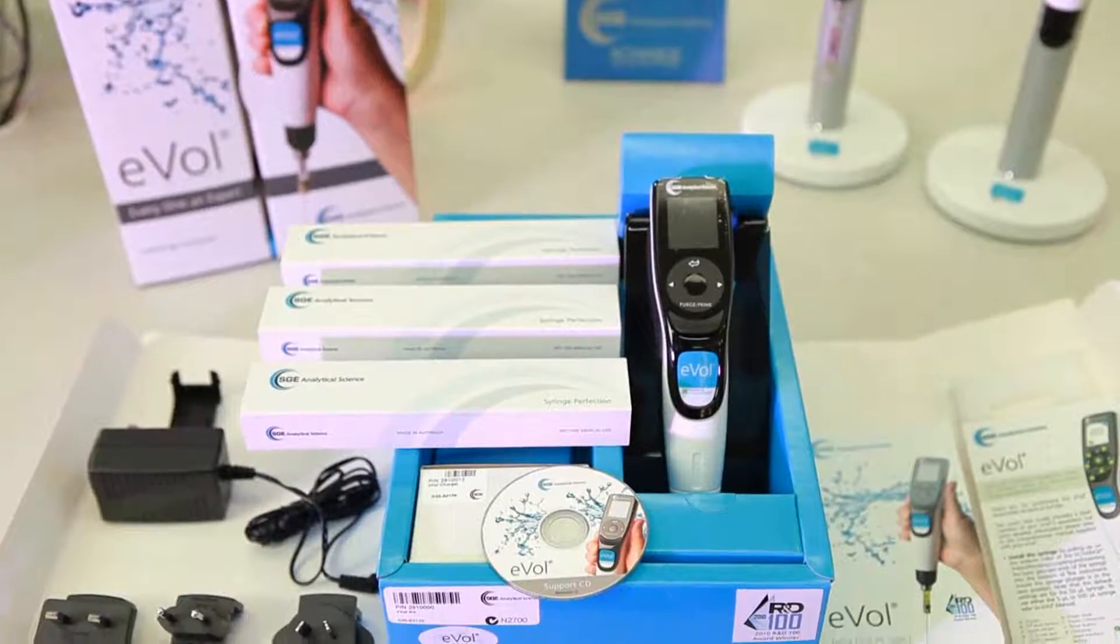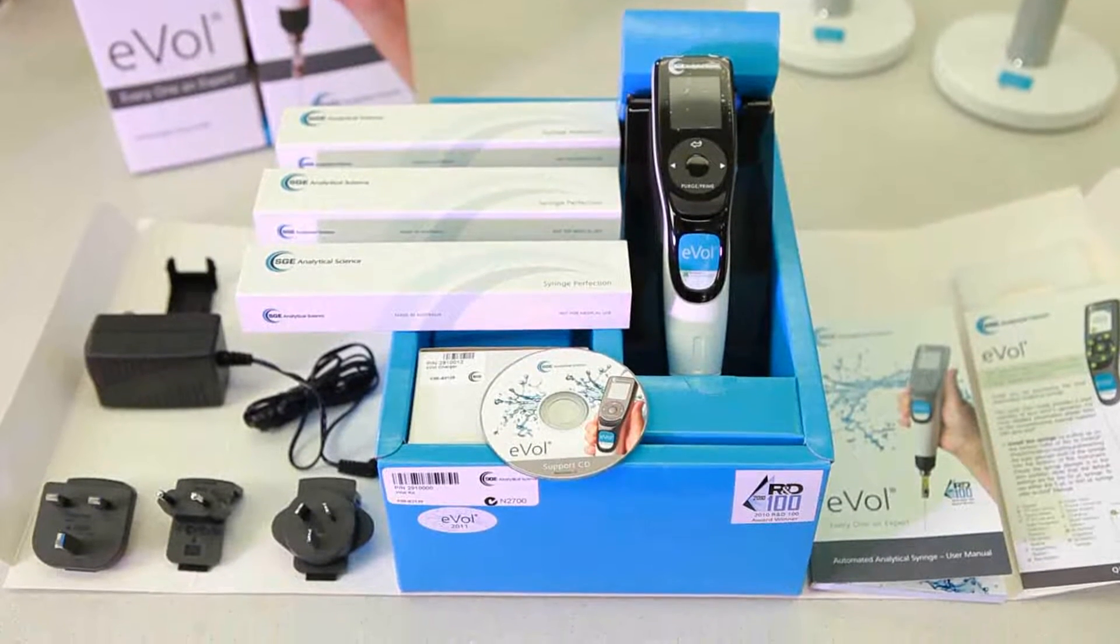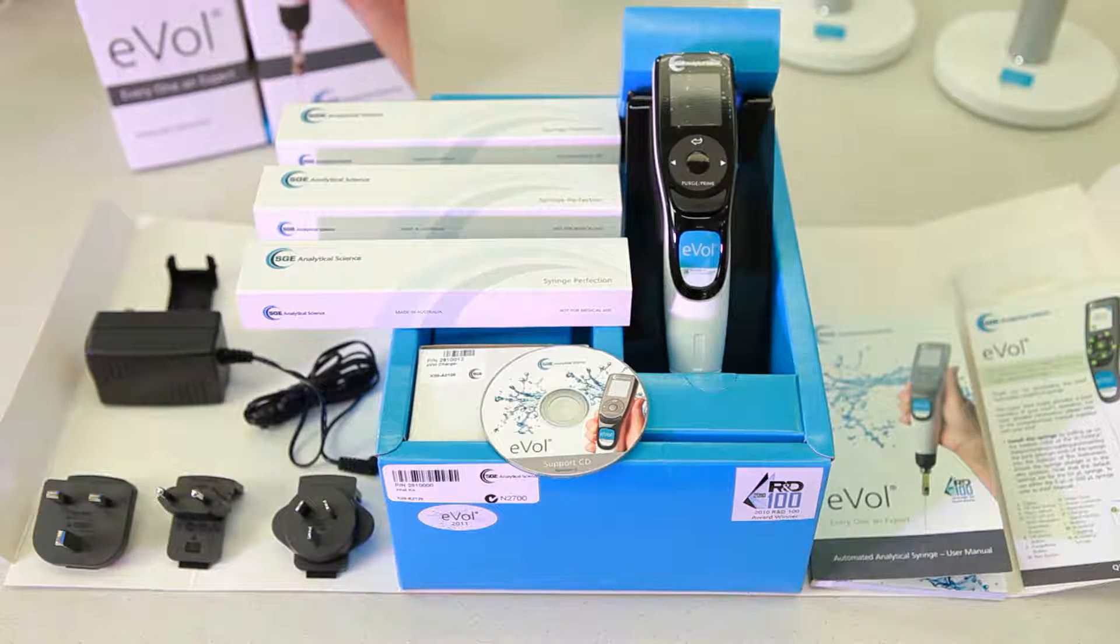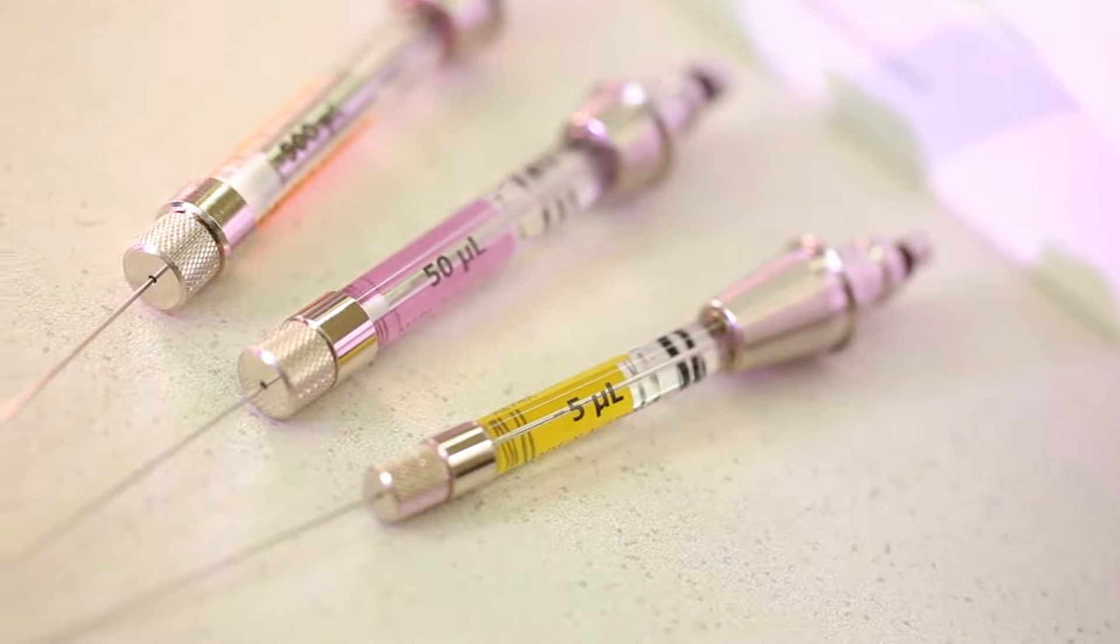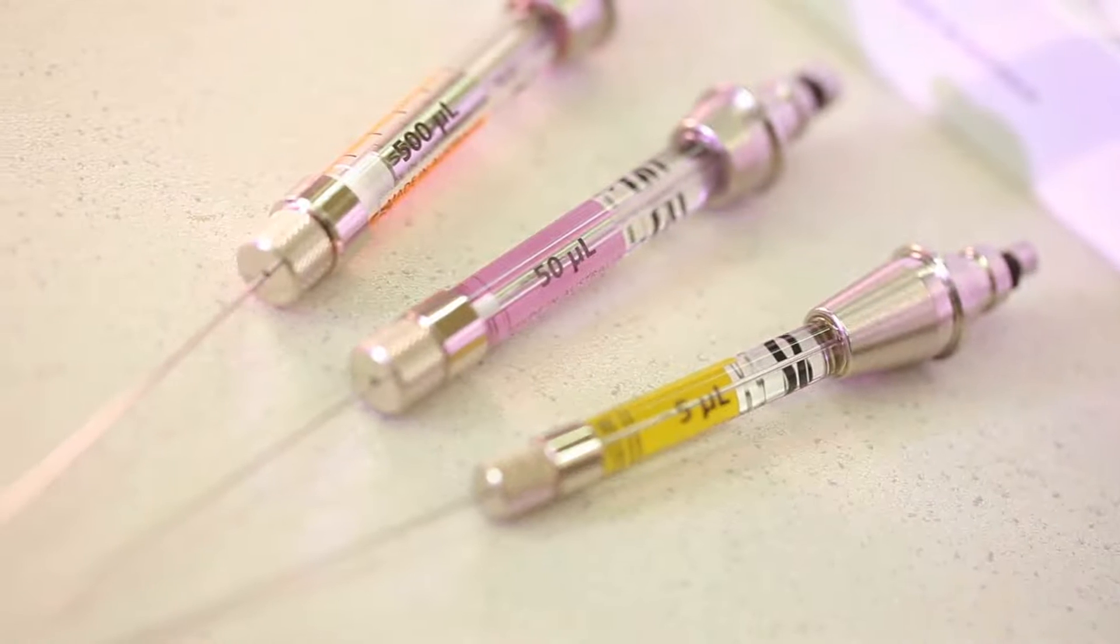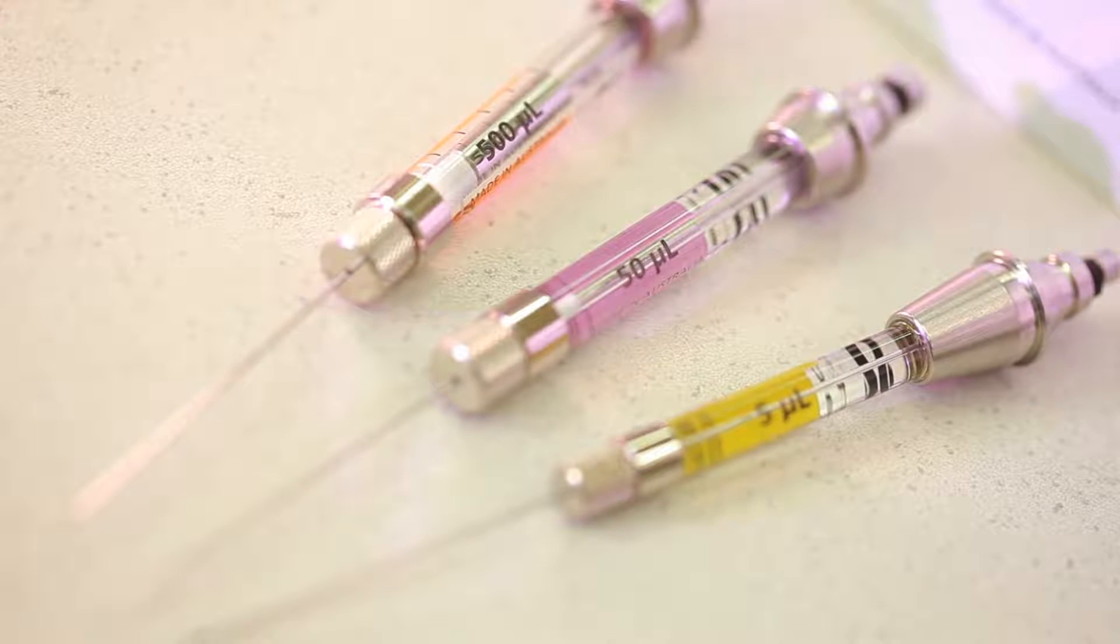The EVOL electronic syringe starter kit contains everything you need to get started, including one EVOL automated analytical syringe handle, one 5-microliter, one 50-microliter, and one 500-microliter EVOL exchange syringe, all fitted with 50-millimeter needles.